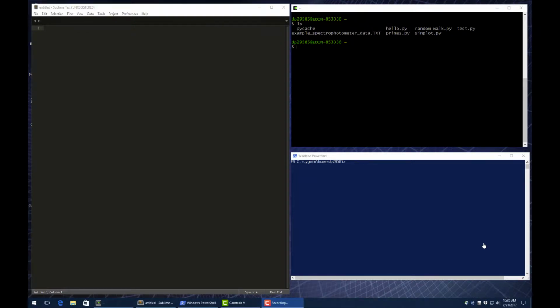I've posted problem 3, which is reading and processing your spectrophotometer data using Python. Before you get into that, I wanted to give you some hints about how I would approach this problem. But the cool thing about solving problems in programming is there are a lot of different approaches, so you can do whatever you want. You can do it like I do, or you can do it a different way, that's totally fine.